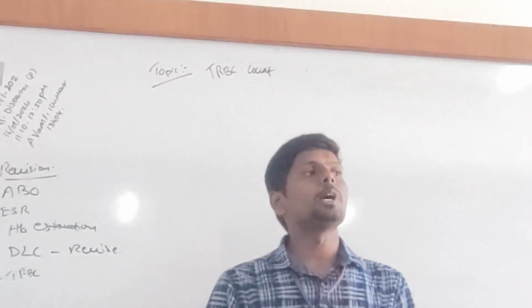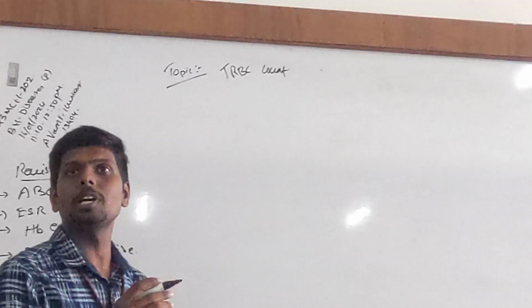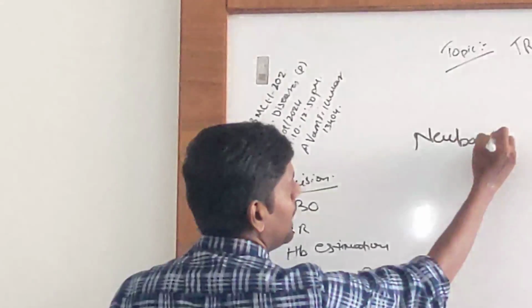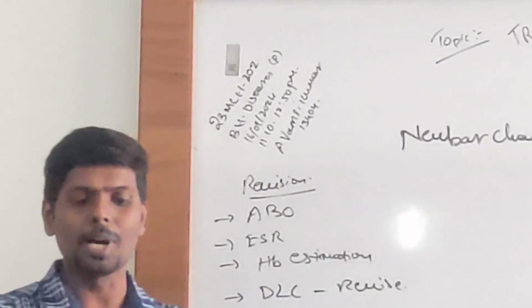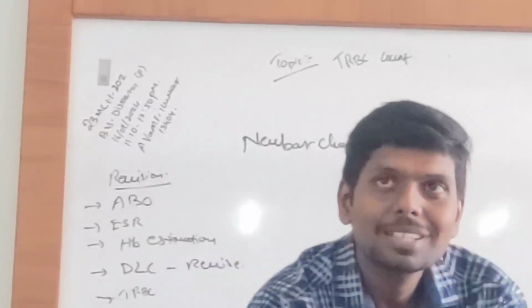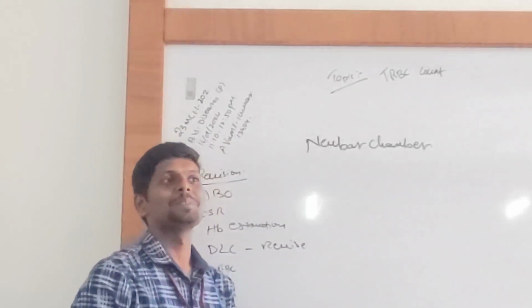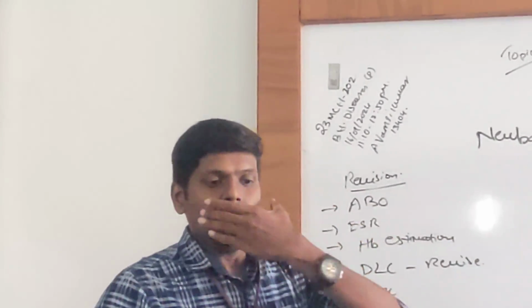Do you know what is Neubauer chamber? Yes. What is the use of Neubauer chamber? To count cells. To count blood cells. Can you tell me the parts of Neubauer chamber? When did you study Neubauer chamber, by the way? Second semester. Okay. Then listen.